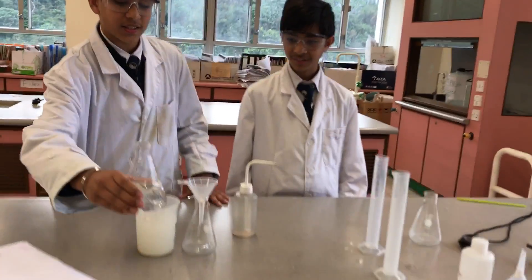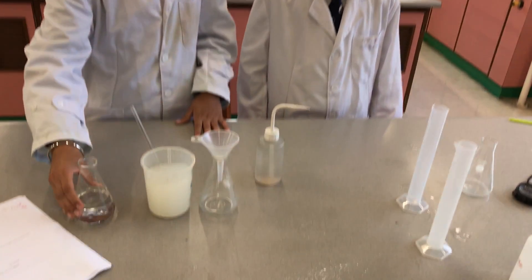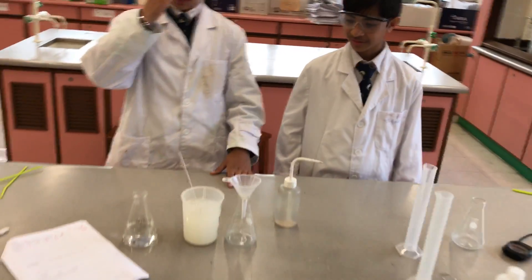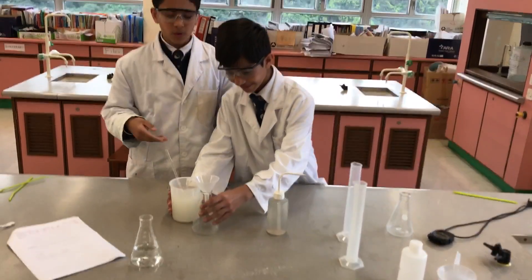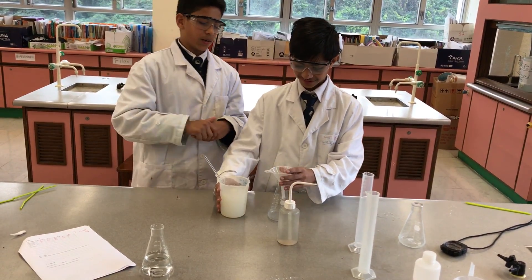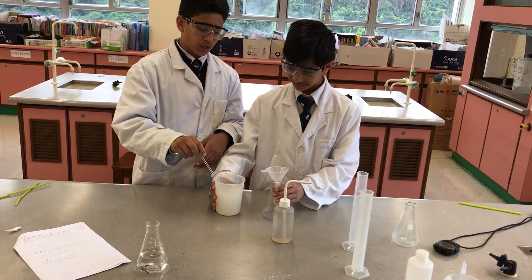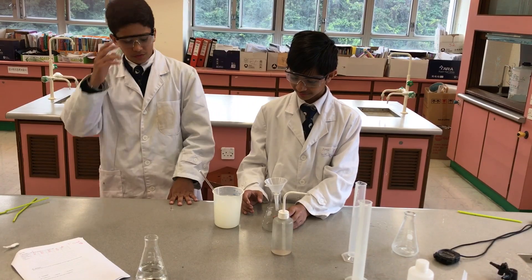As you guys can see, this is a saturated limewater. But if you use this to make it milky and then colourless, it won't happen because it's too saturated. So me and Atau figured out a way to make the limewater go from milky to colourless, and it's by mixing the limewater with water. We're going to do the experiment for you now.